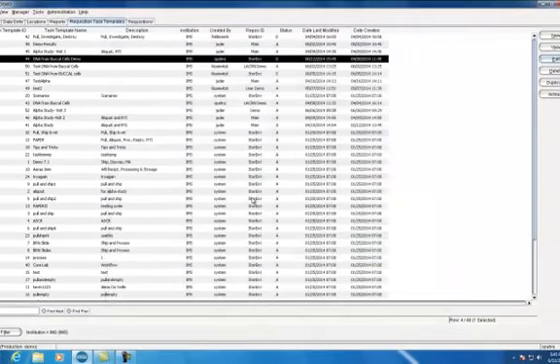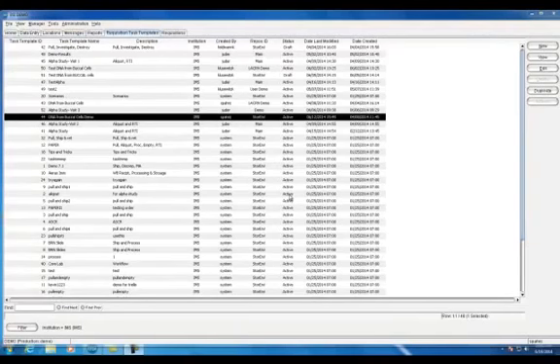I have saved and closed the template, but before it is available to users in requisitions, I must make it active. Pressing the Active button will update the status to active. Now let's see how a requisition with this template behaves. I will now apply my template when creating a new requisition.